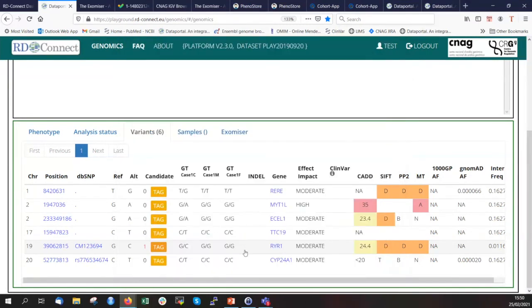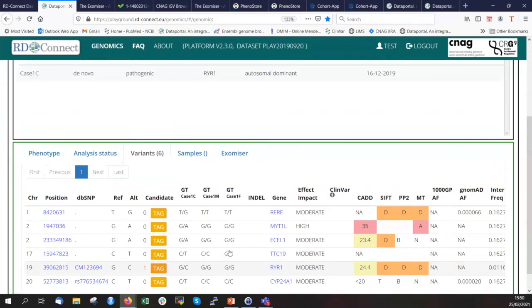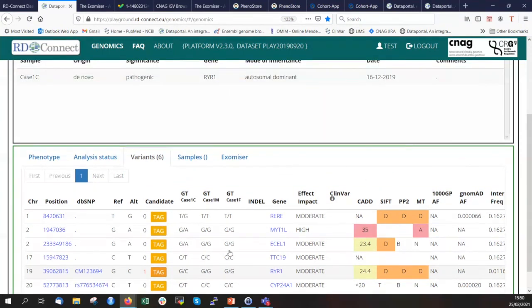This enables you to record the causative information. This will be linked with your PhenoStore entry, so you will have the variant information there. It's also helpful at the community level, as it helps to identify a causative variant, or you can also tag the benign and likely benign variants that you have spent time interpreting, and you can also quickly discard them afterwards.